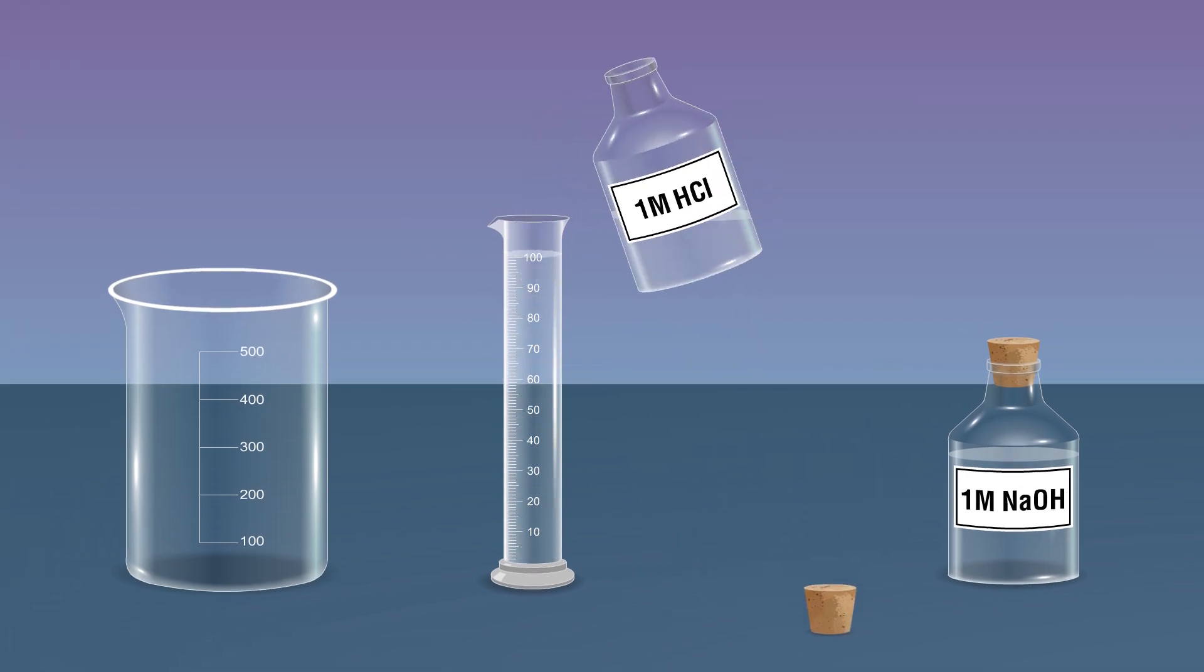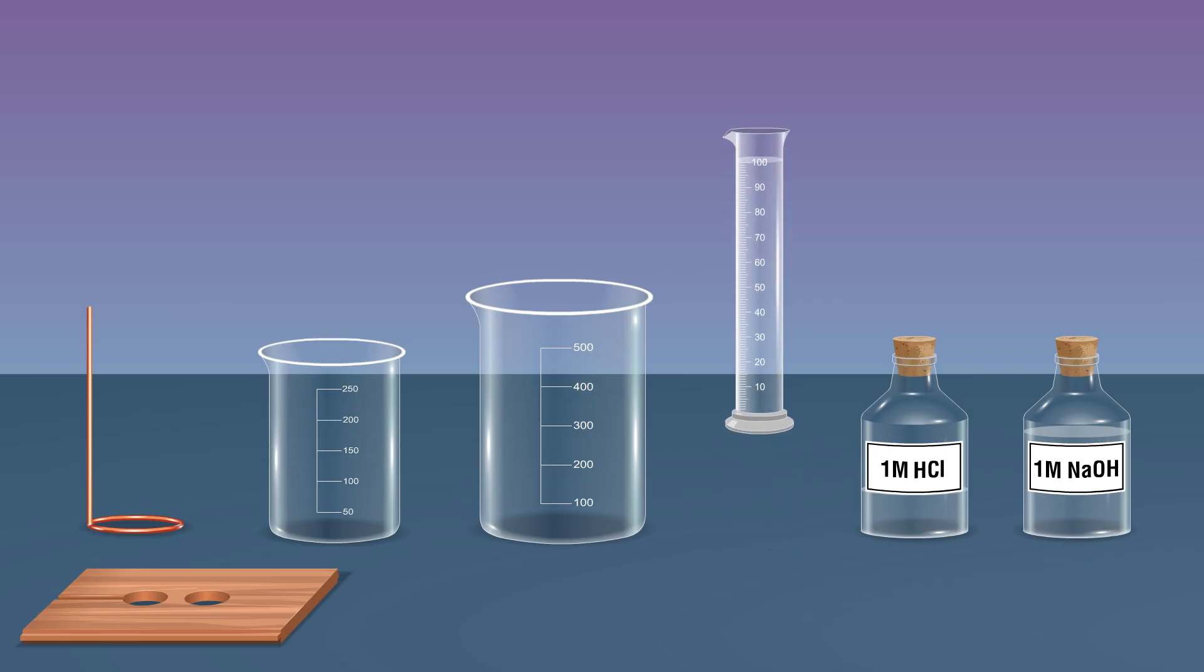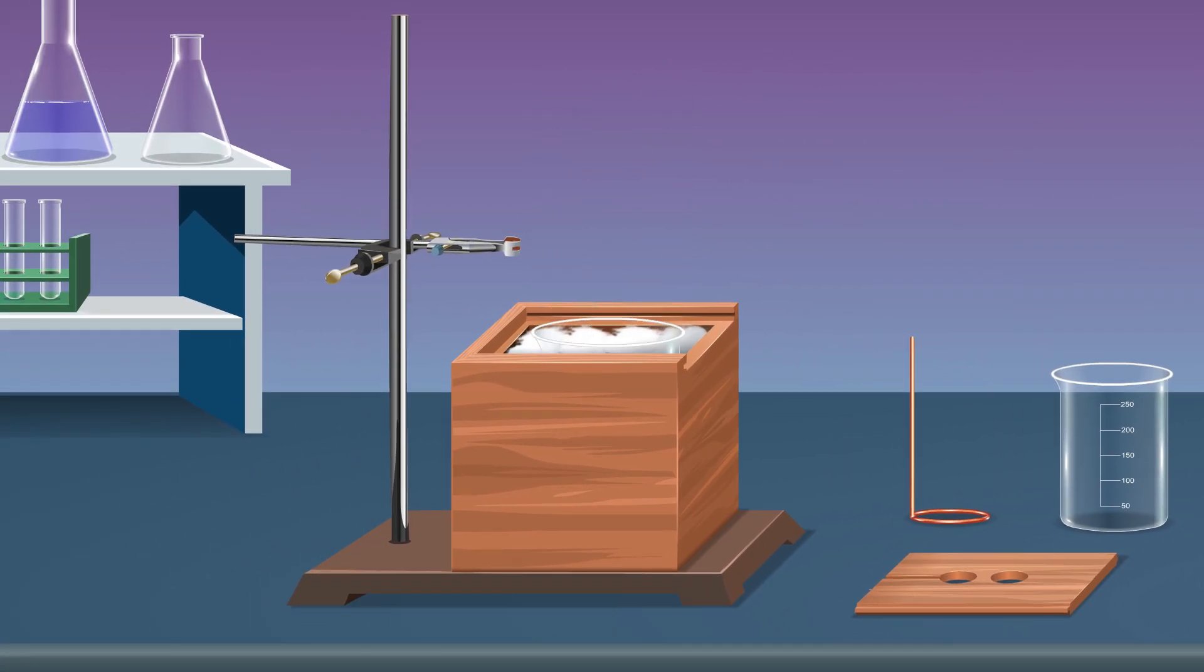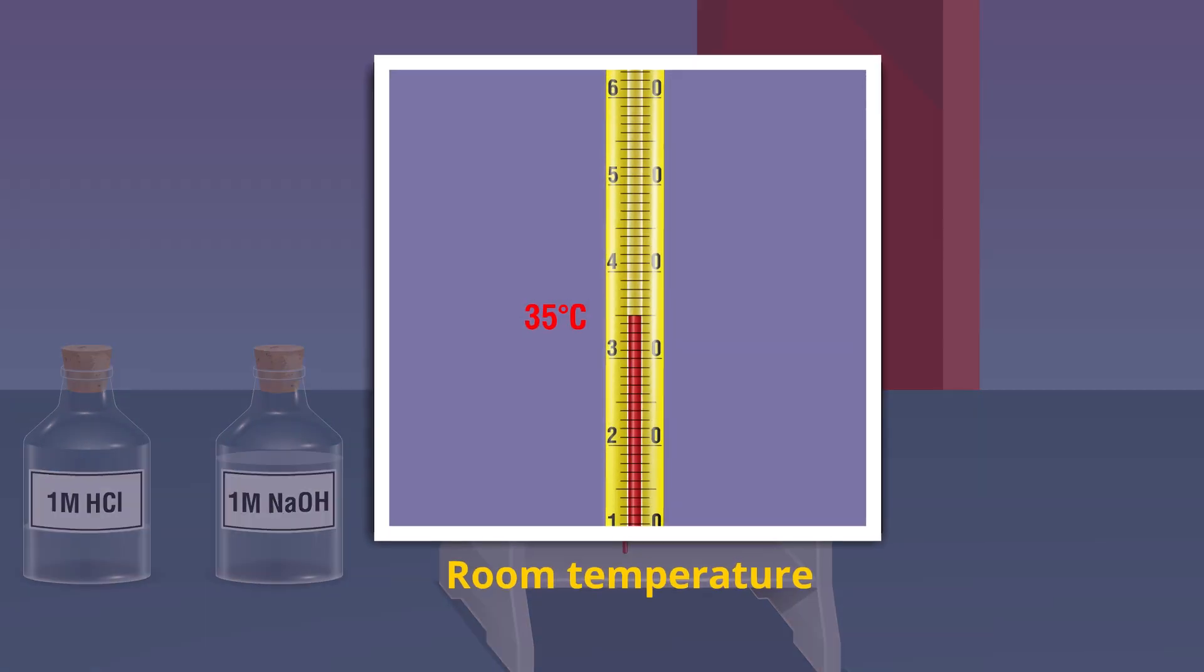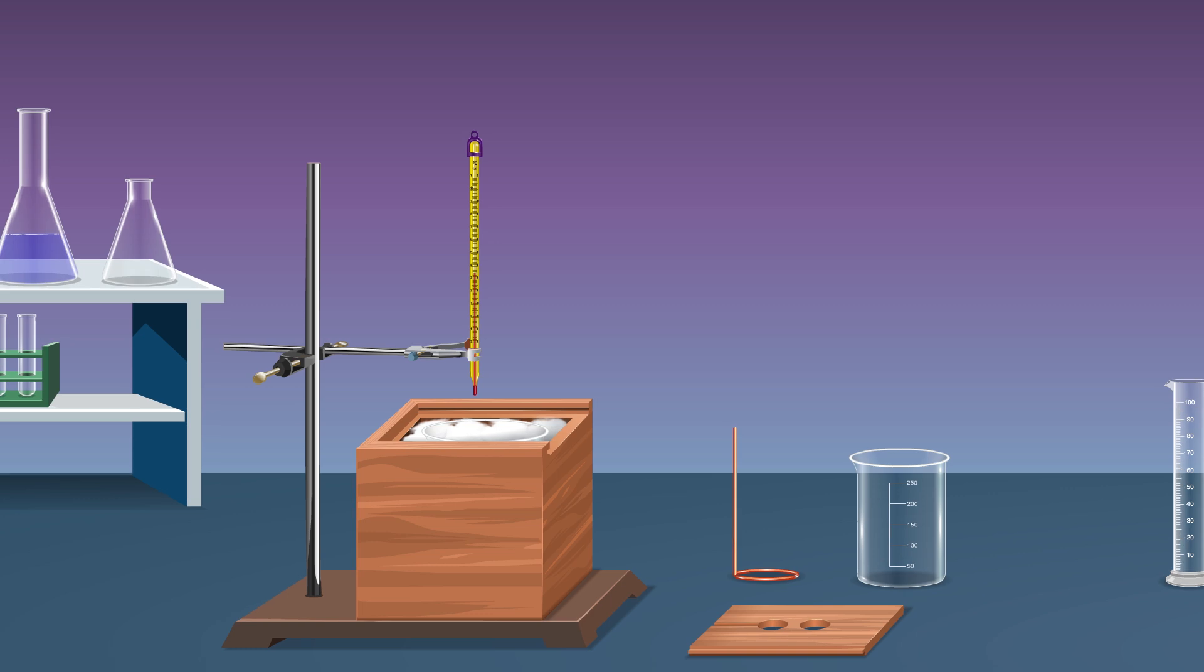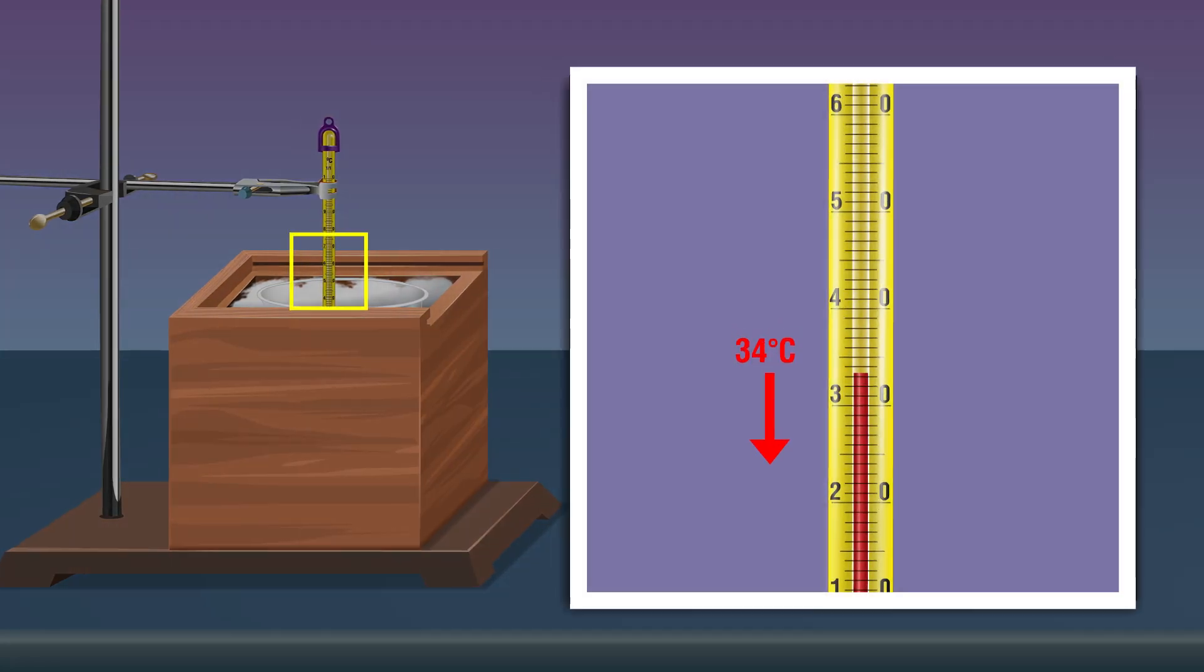Transfer 100 milliliters of 1 molar hydrochloric acid into the beaker using the measuring cylinder. Place the hydrochloric acid solution into the calorimeter. Measure the initial temperature of the hydrochloric acid and record the data as T1 degrees Celsius.